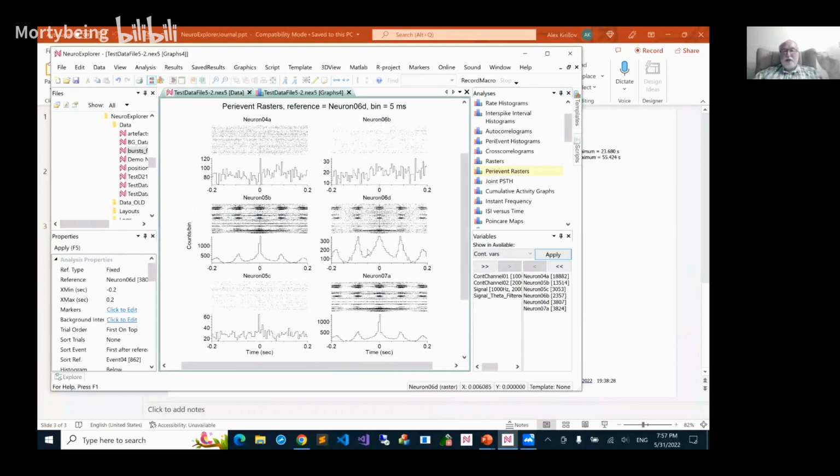So we take a reference of one of the neurons. So guys, tell me if it's something completely out of the main idea: there are these 40 analysis types, and you start looking at your data. First you see, okay, I have these time ticks. Then you say, maybe the frequency changes.